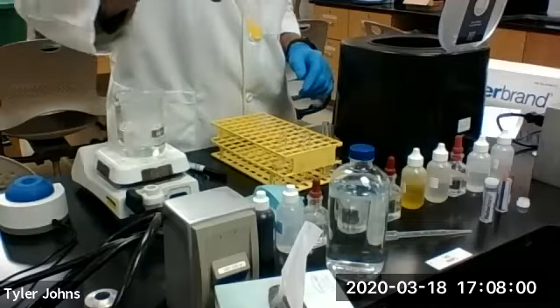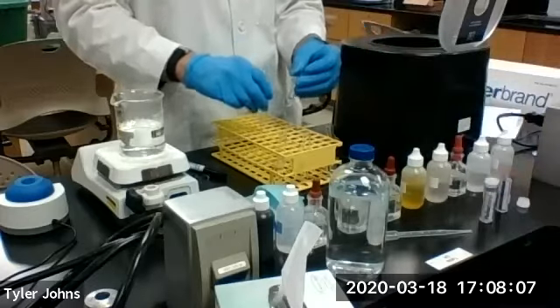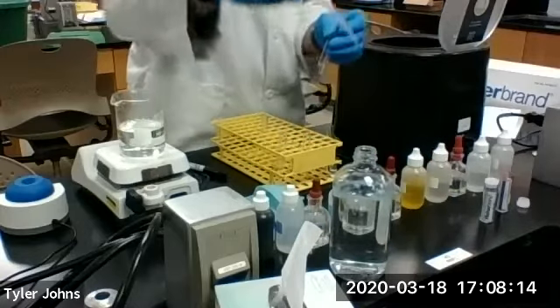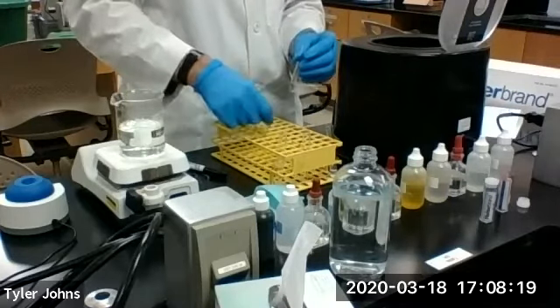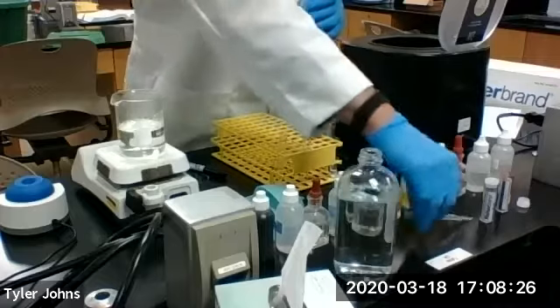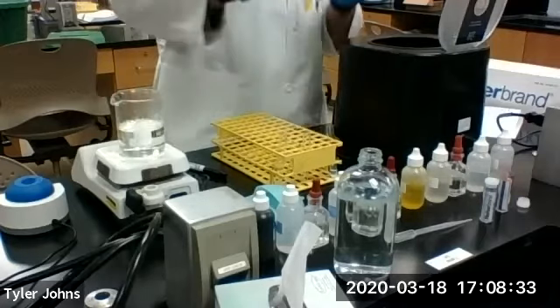We're now going to centrifuge this tube with the balance. We will centrifuge this to precipitate out the barium chromate.